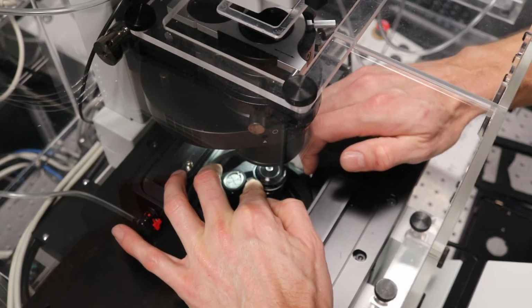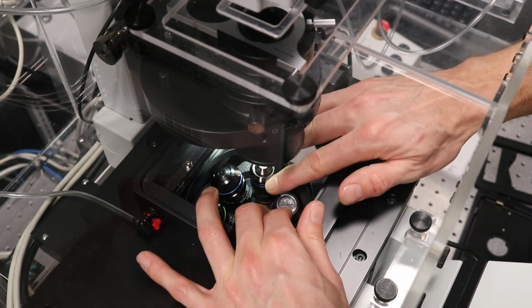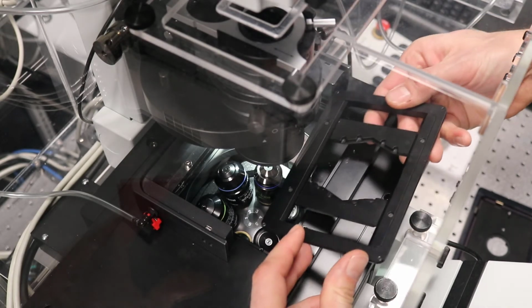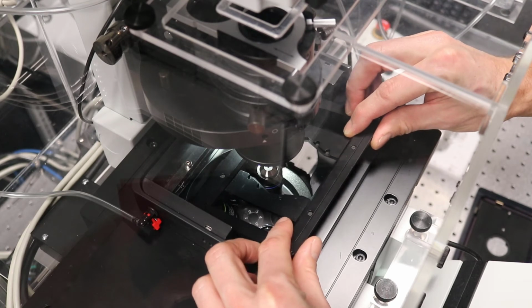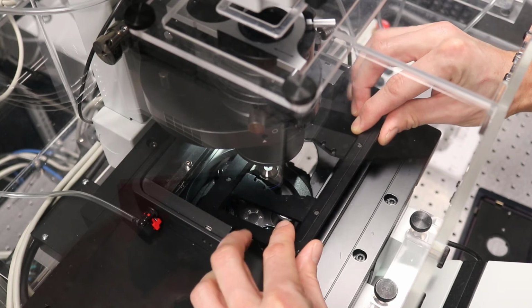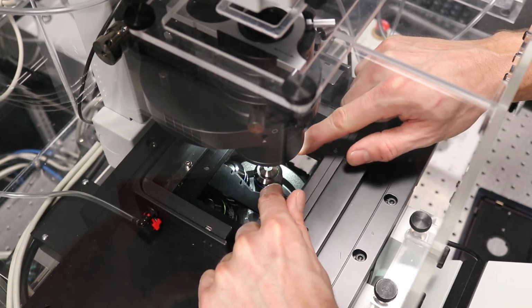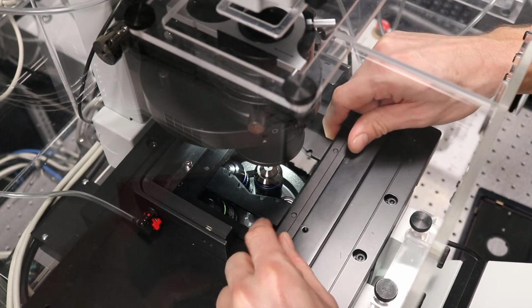When you start the system up in a wide field configuration, it will start up with one of the other lenses, and you need to put in your sample. So let's say you are imaging with the slides, then you insert this slide holder. And you don't put it directly on top because then it will not fit. So you put it in like this and then you slide it in, as with most other inverted microscopes. So now it's completely level and you can put in your slide and take care of the working distance, of course, to the objective lens.